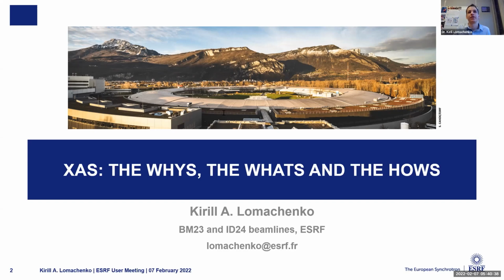Like rare earth metals and carbon. Yeah, there it's fine, because rare earth metals are different from carbon, right? So the only thing that you will get in your data will be the signal from the absorbing species that you're interested in. And there, depending on how fast you want to measure, you can go way below percents.